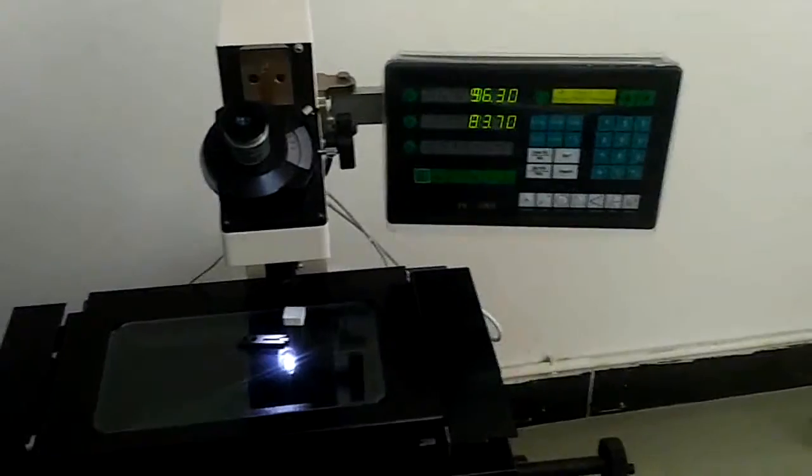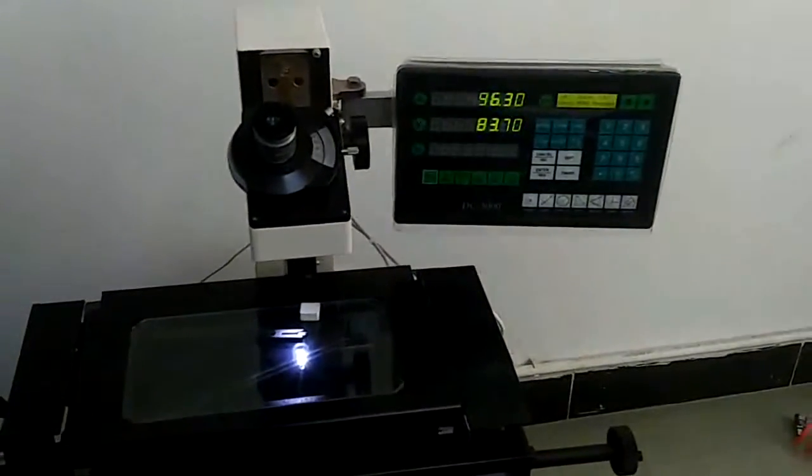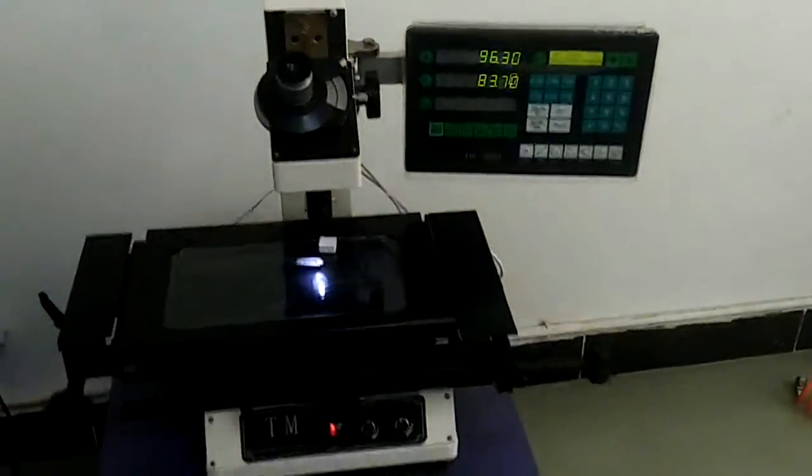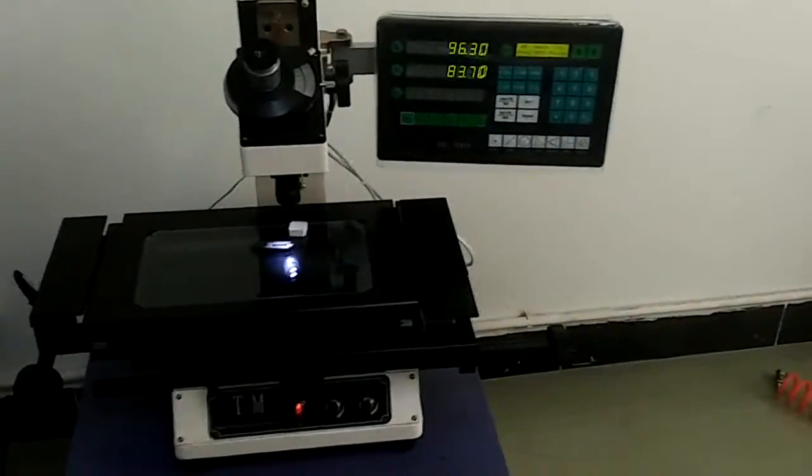Okay, here is the measurement microscope of our company, MMA2010. Thank you very much. And thanks for our engineer's support.